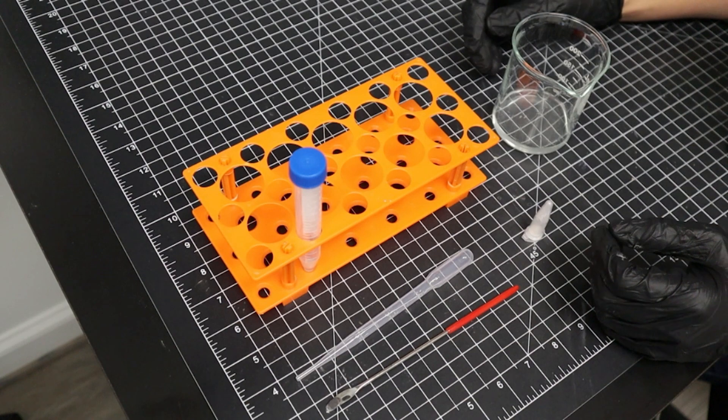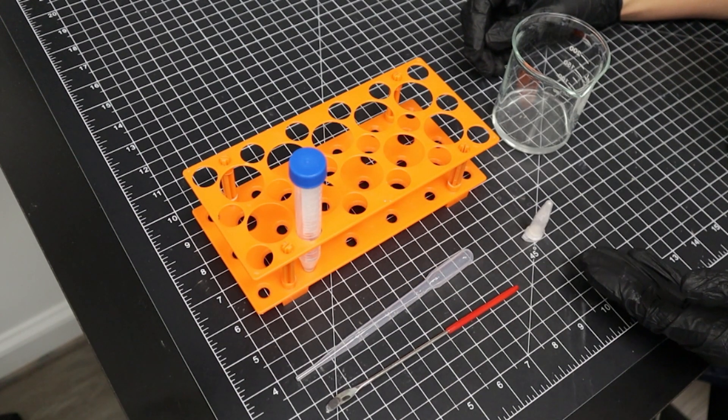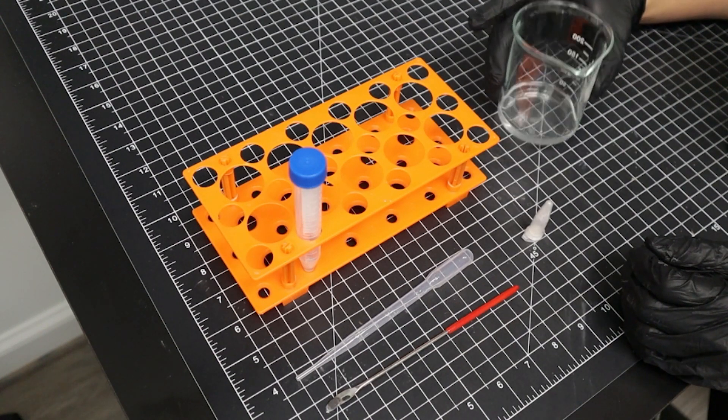Creating a solution is quite simple. You'll need a vial, a pipette, your powder, a metal spoon, and a solvent.